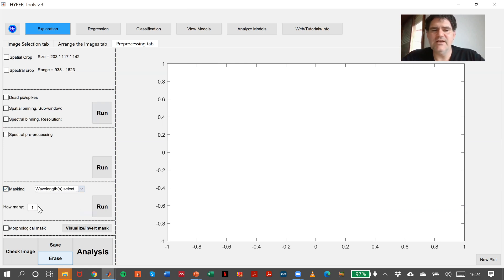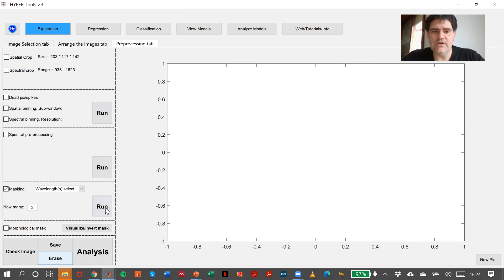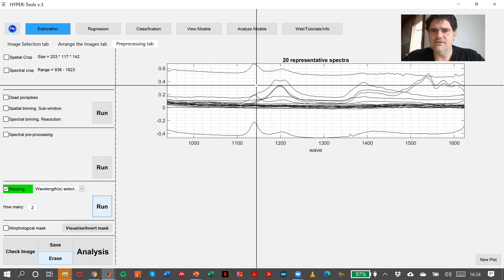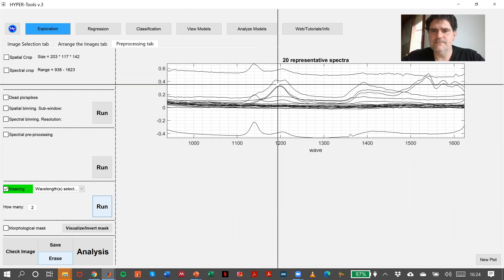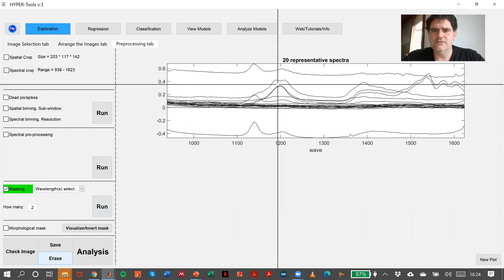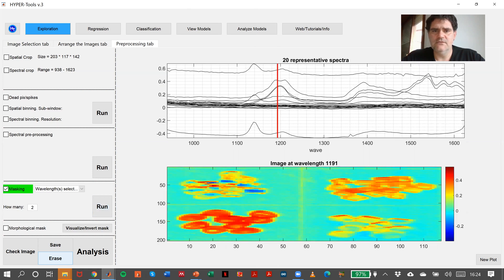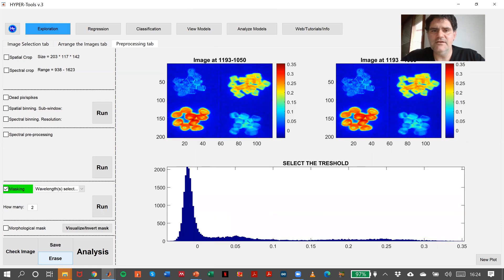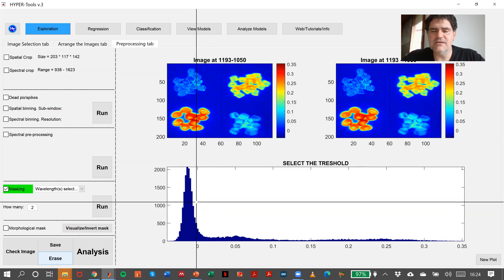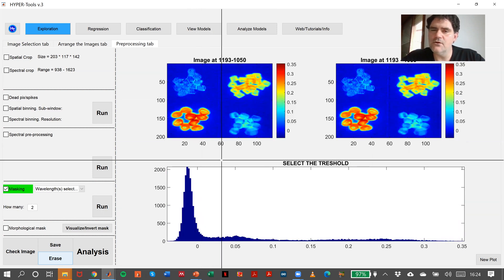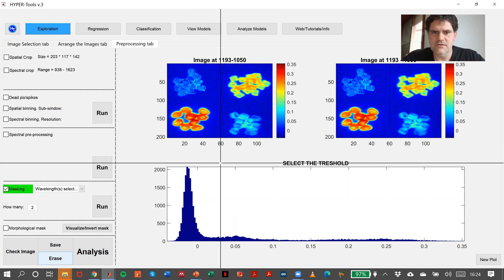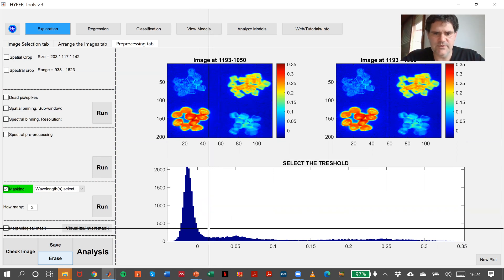In this case, we can select one or two wavelengths. If we select two wavelengths, we can select, for instance, this one and this one. What we have here is the histogram displaying the ratio of the intensities in the wavelengths.